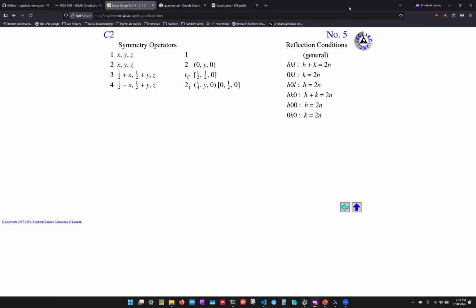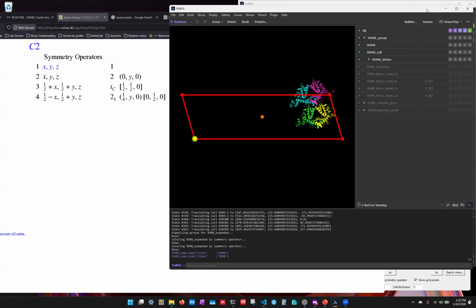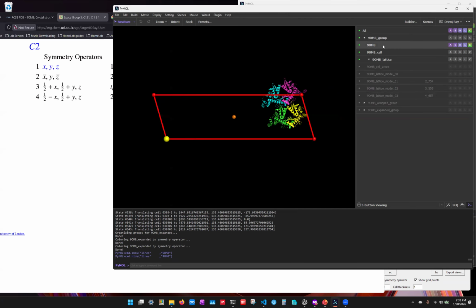If you ever get stuck, Han Wing and Brian Shelton can explain this stuff. They're classically trained. They know this stuff inside out. Yeah, Ong was teaching us this math stuff in a third-year methods class for crystallography, and it scared me to death. So I don't really know how to interpret these operators, but just know that each space group will have a certain set.